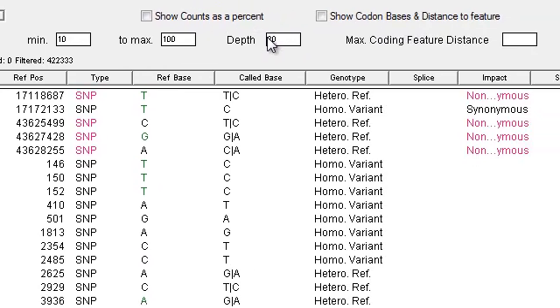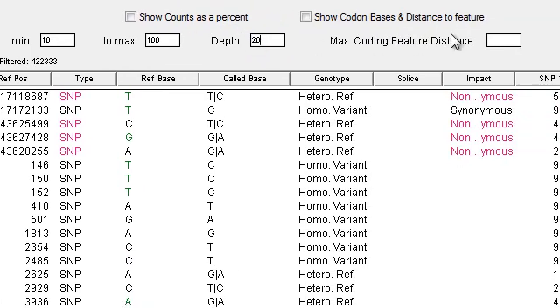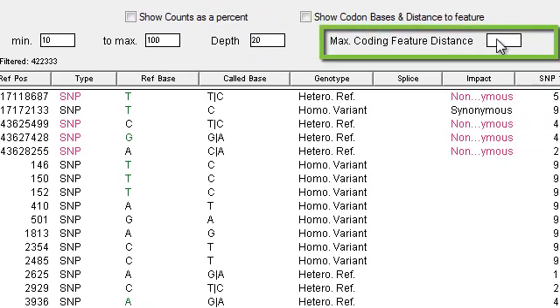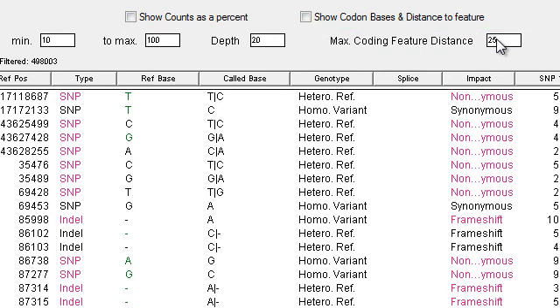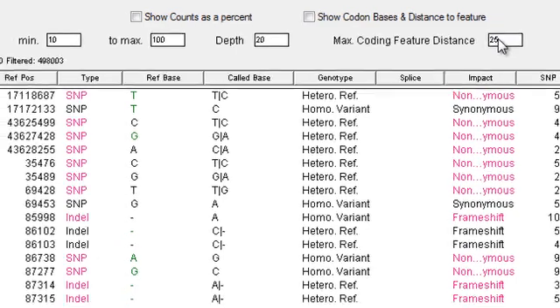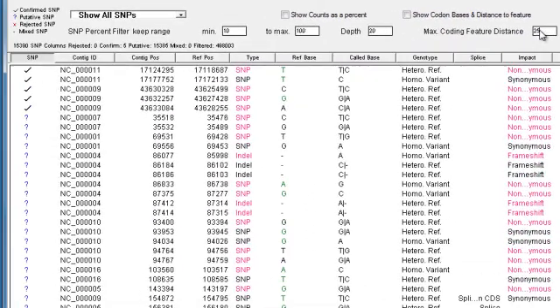And another filter I want to apply is max coding feature distance. I'll enter 25 here and now SeqMan is only showing me SNPs that occur within 25 bases upstream or downstream of a CDS.